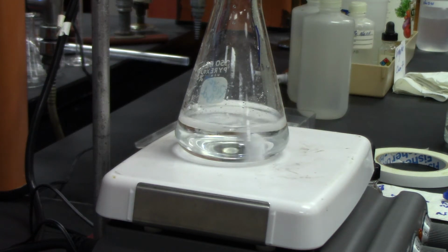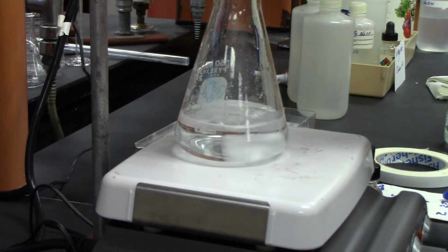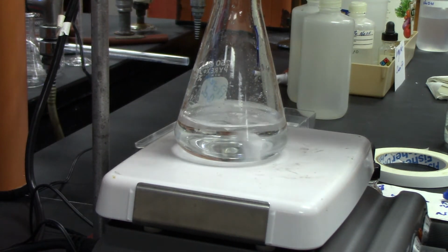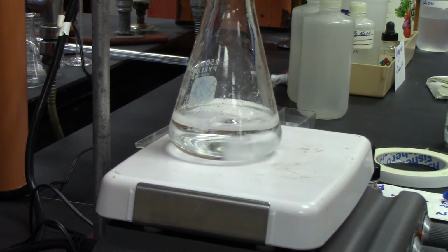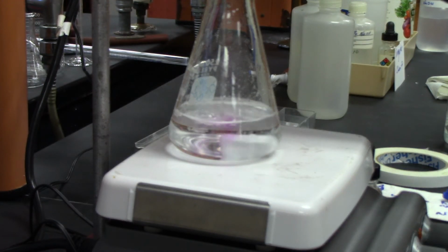The starting value is 31.91. So pay attention to what's going on here. I should have made a higher concentration of the sodium hydroxide, it looks like. I hope I don't have to do this again.